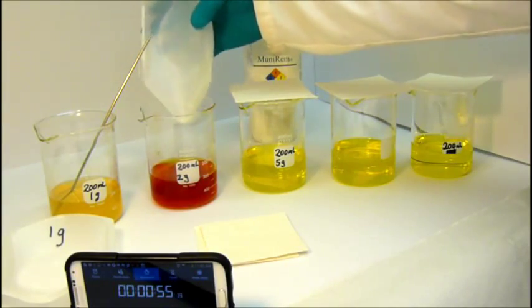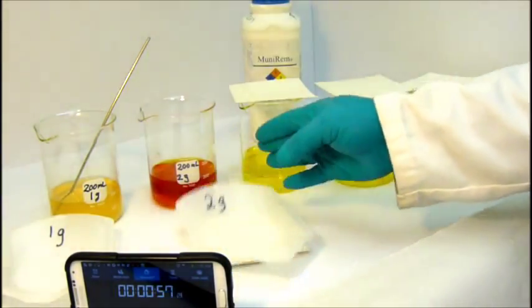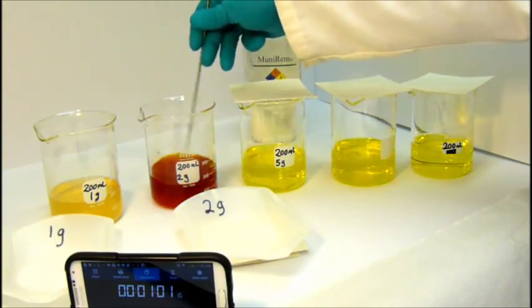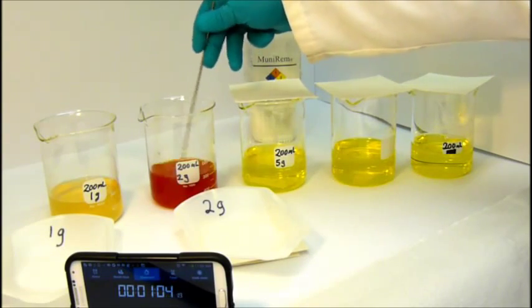While you are seeing a bench scale test, the effectiveness of Munarem at field scale has been proven and the same results have been achieved in large-scale field demonstrations and remediation projects.